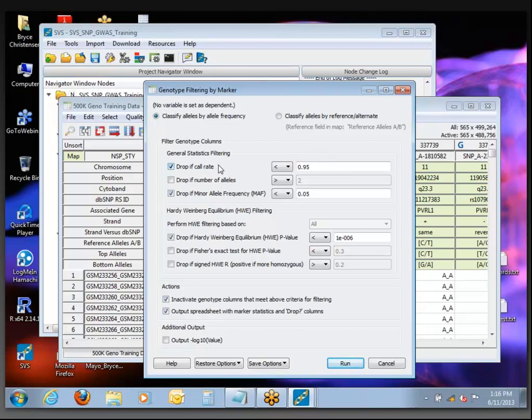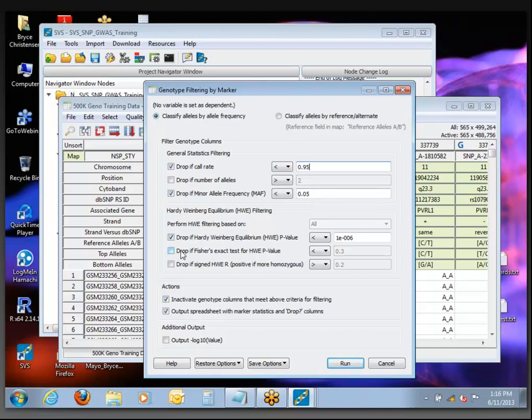We want to set it up to filter based on a call rate at 95%, minor allele frequency less than 5%, and down here on Fisher's exact test for Hardy-Weinberg equilibrium. The only difference from the chi-square test is the statistic — we're going to use Fisher's exact, which is what is in the tutorial. It says to enter 1e-5, and the dialog does allow you to enter things in scientific notation just like that.